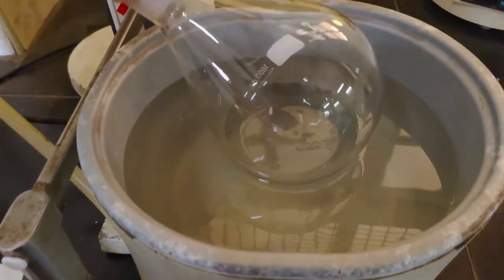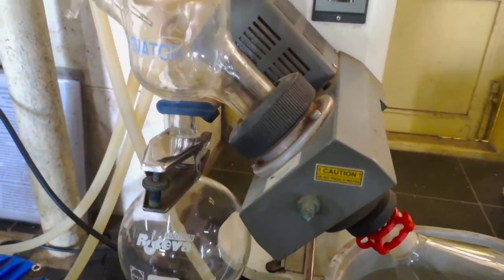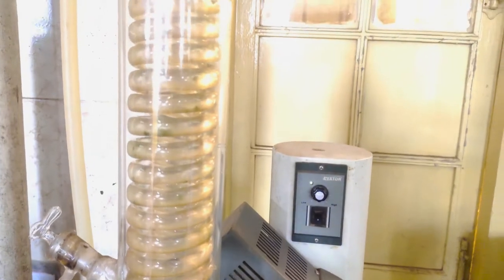The solvent boils well below its normal boiling point due to the very low pressure generated inside the flask.